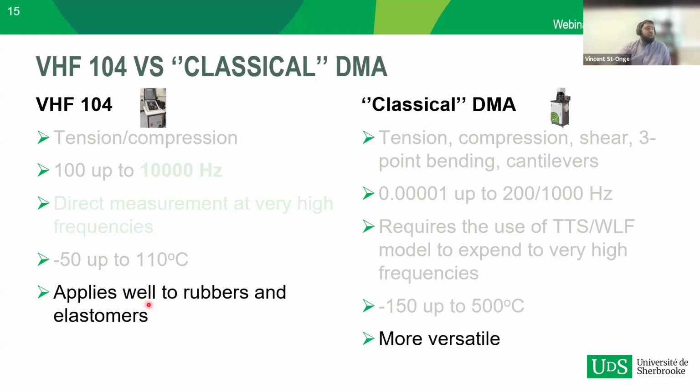And one of the limitations, I would say, of the VHF-10-4 is that it applies very well to rubbers and elastomers, but not necessarily as well to harder materials. So in that aspect, the classical DMA would be more versatile.